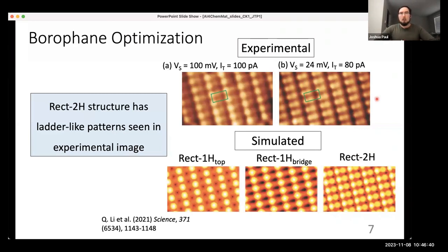That is one thing to note for the software that I'll get more into later, but the STM images are taken at a specific bias voltage relative to the Fermi level. We replicate that with DFT, but that is one point that you're pinning against. If you have the option with an experimental collaborator, ideally they're able to take multiple bias voltage images, and that provides more avenues to validate theoretical results against experimental.